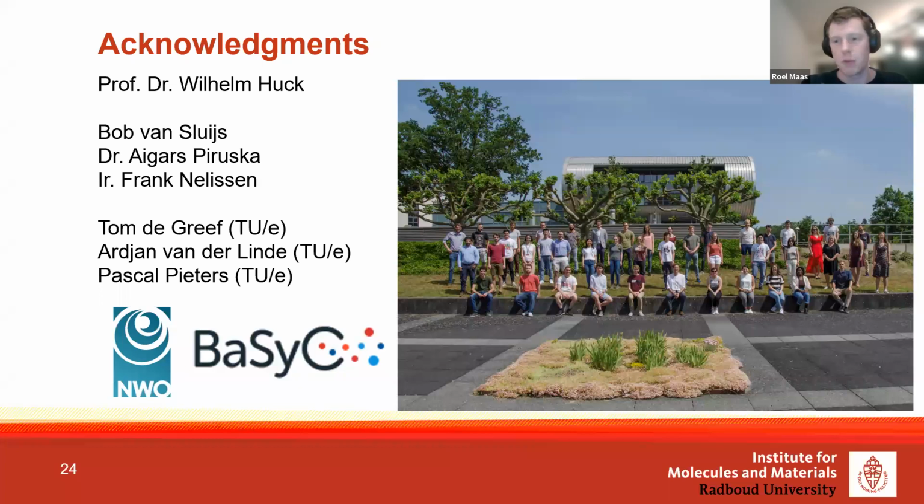And of course, at the moment, the model we have is a simple model. We didn't include resource competition or energy consumption of all the different parts. But I think there's always a fine balance between the complexity of the model and the amount of data you actually have. So if you increase the database size, you can also increase the complexity of the model along with it and get more and more information, going deeper to the mechanistic understanding of the system.